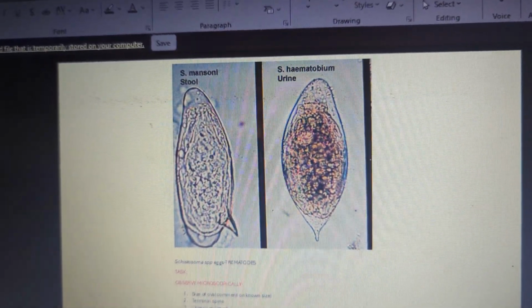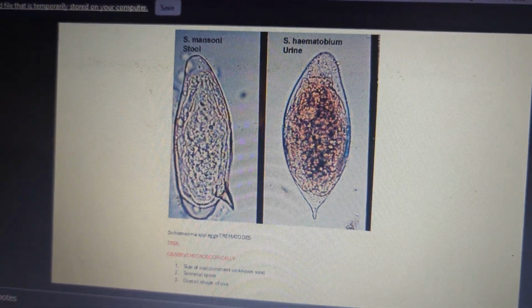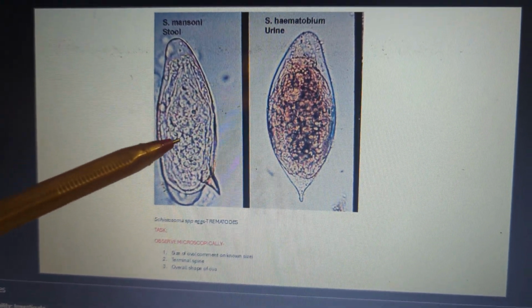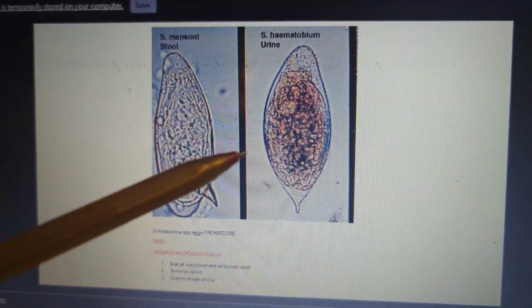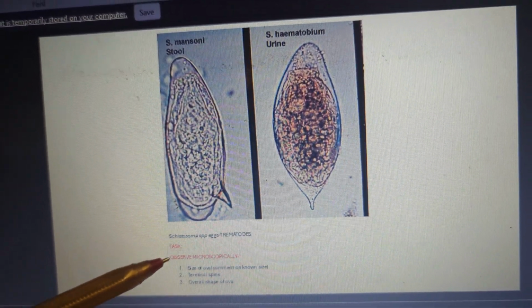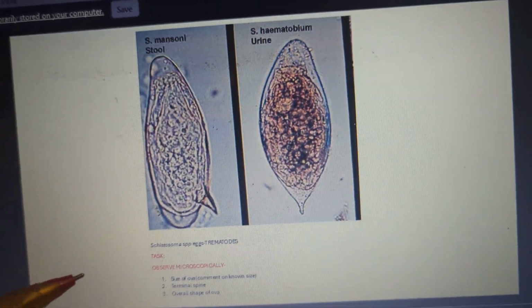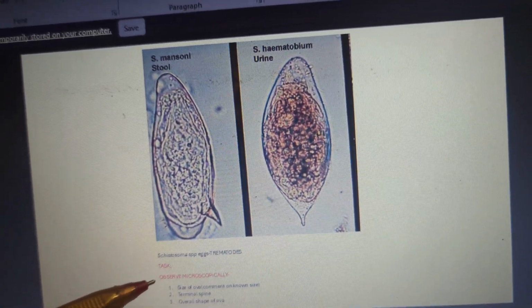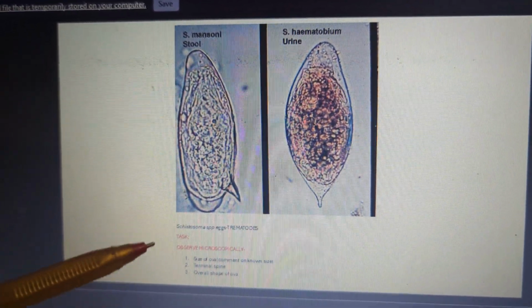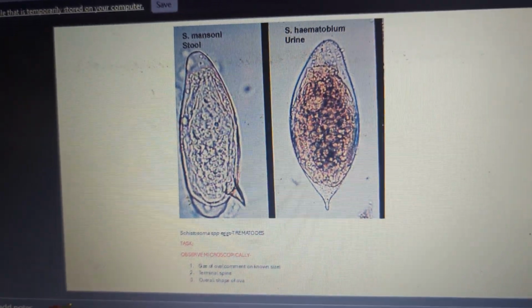Okay, so here we are. The trematode, the bench aid that you will find looks like this. Okay, and then of course the stations are supplied, the actual microscopy of these images seen here. Okay, and you have a task on the bench aid just guiding you, to point you in the right direction when you're trying to make the observations. So please read the task.